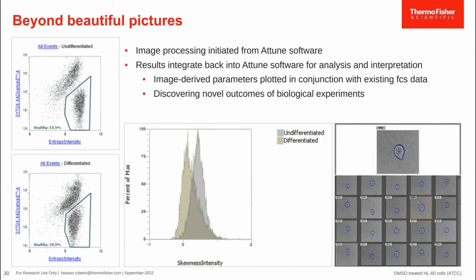But our differentiated cells, which happen to be differentiating into neutrophils, become smoother and much rounder than the original HL60s. So it was exciting when I started to dig into this and see that this might actually be an earlier indicator of differentiation that I could then use to help me time my downstream work, which is neutrophil migration and phagocytosis assays.